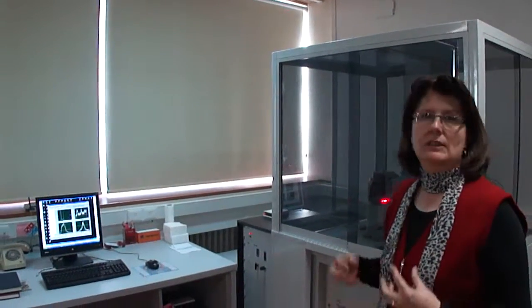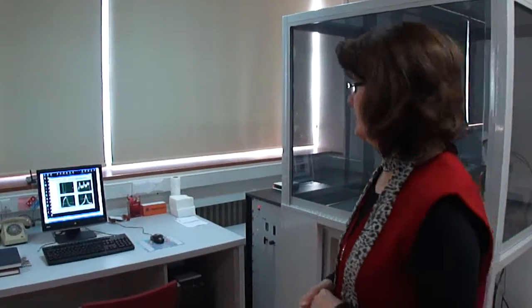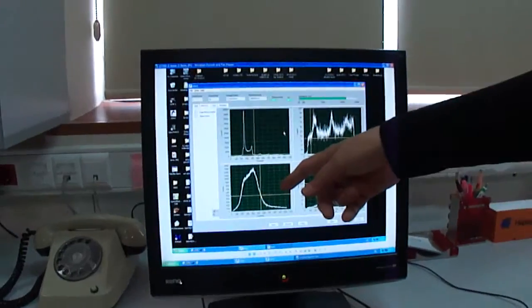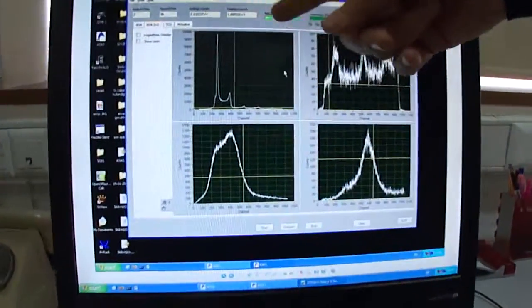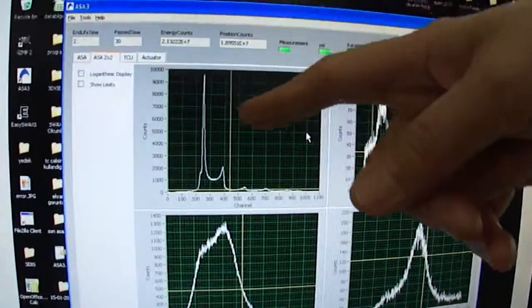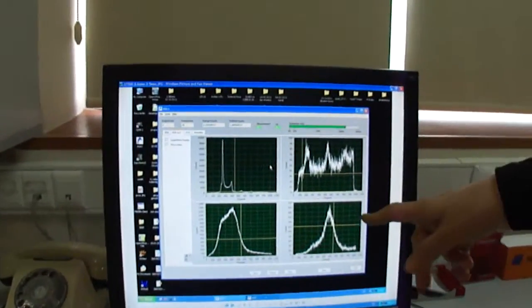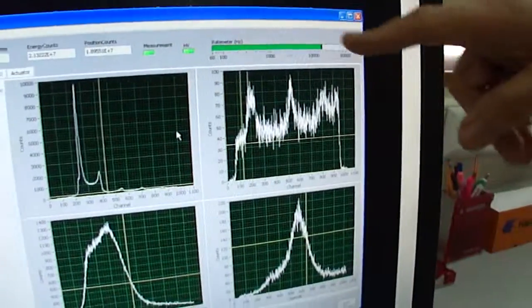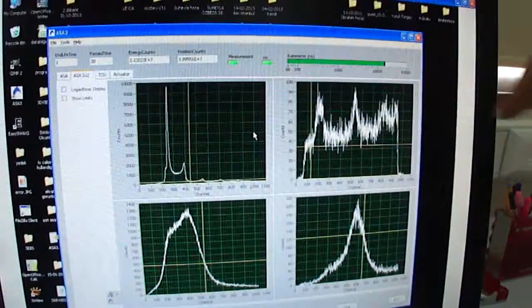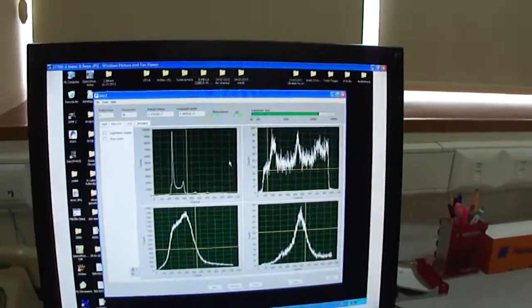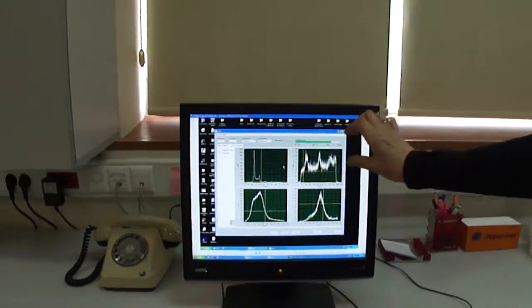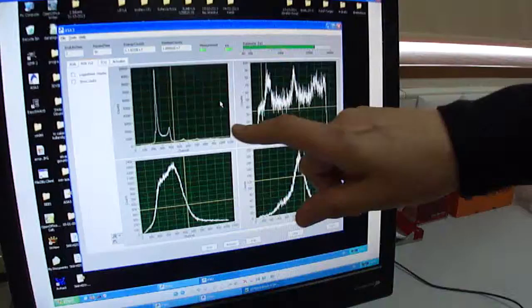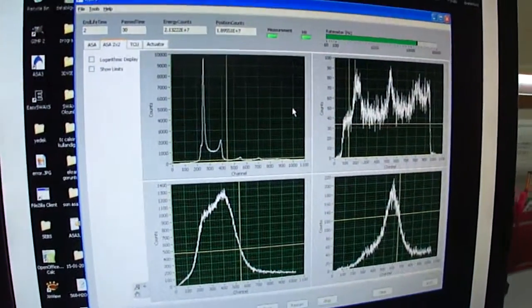We are choosing the best nanostructured samples. You may also see the SAX detector's information, and we are recording nanostructured aggregation information in this SAX pattern. This is also WAX detector information, and we are recording WAX pattern related with the sample. You may also see that the molecular side structural information will be here, and the nano side structural information is here.